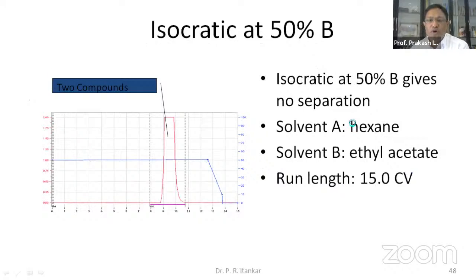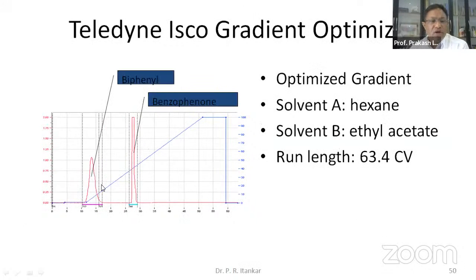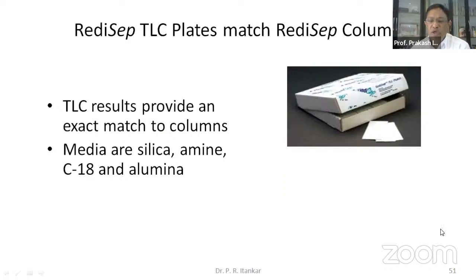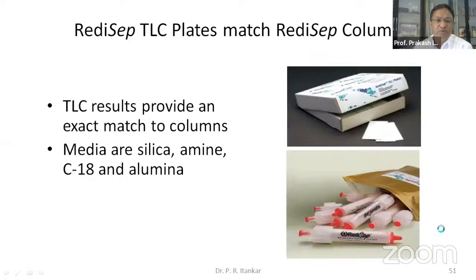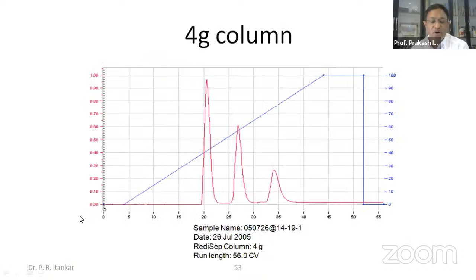So I'm coming to the close of this demonstration. Normal gradient can be there. What remains in the mind of a researcher is that to get 2 distinctly placed constituents, they should be absolutely separated from each other. They should be free from any mix-ups. They should be discrete, and one can really get them as a single discrete constituent, which can be taken up further for characterization purposes. So based on the column size also, just like we have seen that the software can help in optimizing the gradient of the solvents in separation, similarly, you can achieve that by selecting the proper columns.